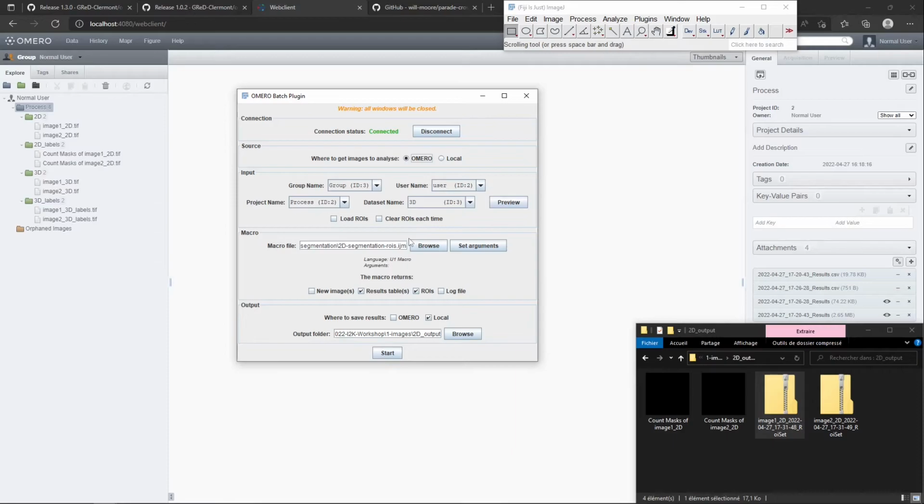Maybe one day, but for now, you can only choose an input and put that wherever you want, but you cannot change how the input data is organized. So that's one limitation. However, that's something that the second plugin may help you with.